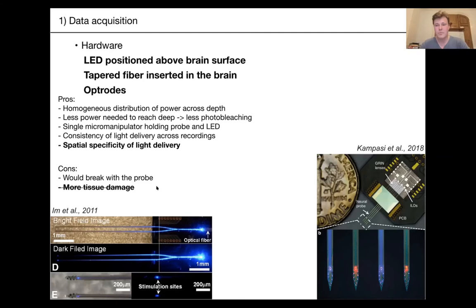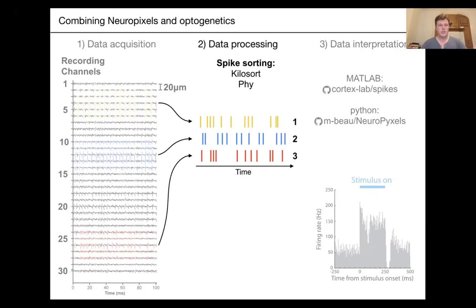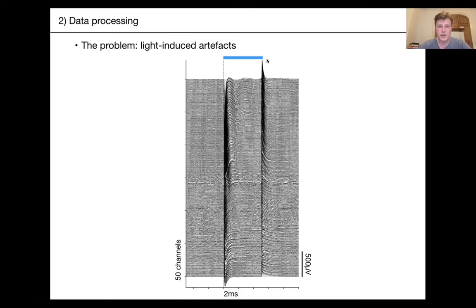Now the most interesting bit — preprocessing and how to handle opto artifacts. These are the problems you're dealing with: you can see in blue the duration of the optostimulation, with electrodes on the y-axis. At the onset of stimulation there's a negative artifact; at the offset there's a positive one. You also see an initial sharp period in the artifact, then a slow oscillation.